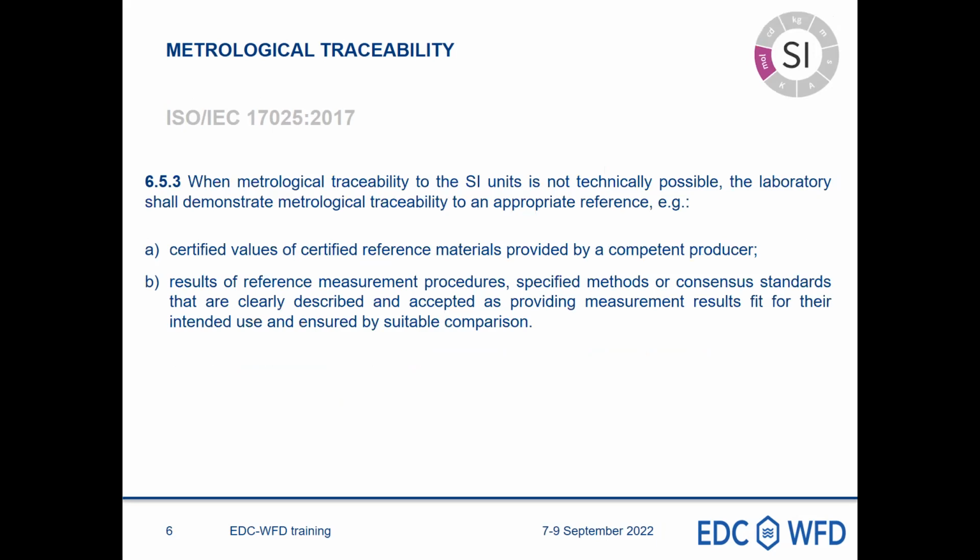Third point: when metrological traceability to the SI unit is not technically possible, the laboratory shall demonstrate metrological traceability to an appropriate reference, which could be a certified value of a certified reference material provided by a competent producer, or the result of a reference measurement procedure, specified method or consensus standards that are clearly described and accepted as providing measurement results fit for their intended use and ensured by suitable comparison.